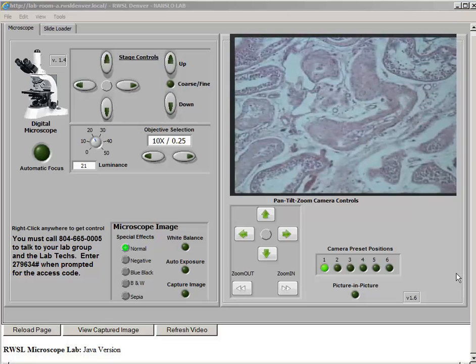A microscope mounts an objective lens very close to the object to be viewed. Depending on need, different lenses with different power will be used on the microscope. This microscope features multiple objectives, each with different power, mounted on a rotating turret. The larger the magnification numbers, the greater the magnification.